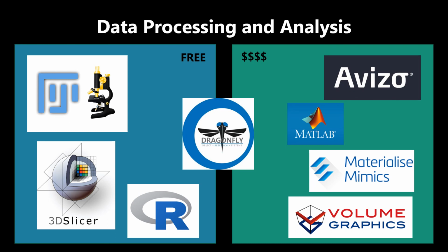Last but not least, the data must be analyzed. There are a variety of programs, some free, some not, that can be used to further process and analyze MicroCT data. Some of these programs are listed here.